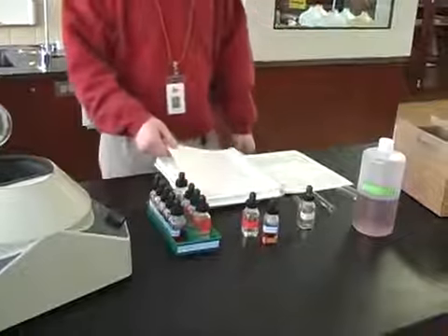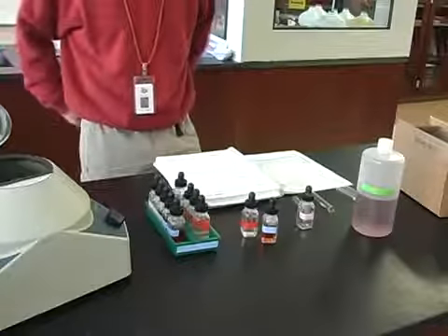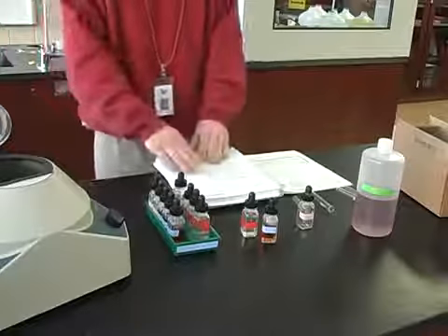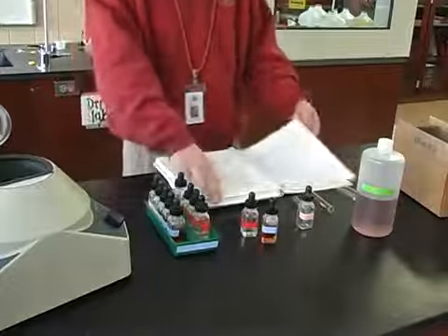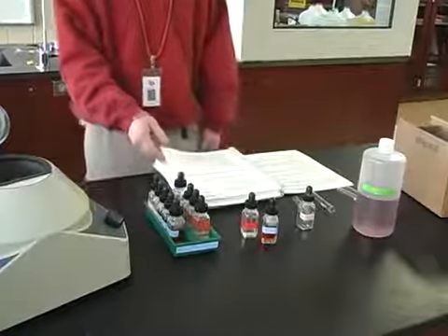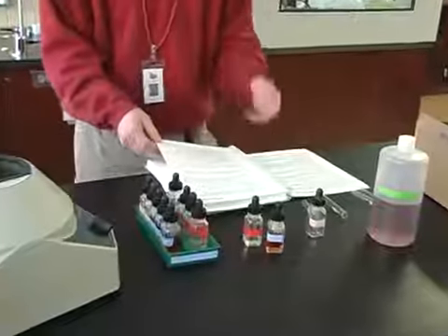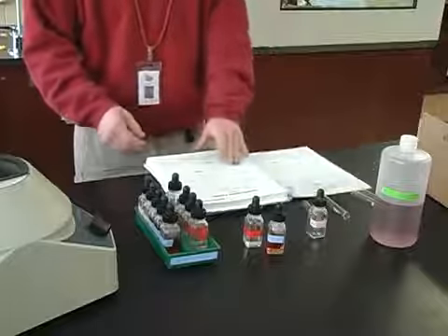Okay, if you turn the page, you can see that the lab actually starts on pages 126 and 127, and they give you a step 1, 2, and if you turn the page, there's a step 3, 4, 5, and you can turn pages for many, many pages in here to actually find that there's at least 15 or so steps, and each step involves some different reactions. And then there's a number of discussion questions at the end.